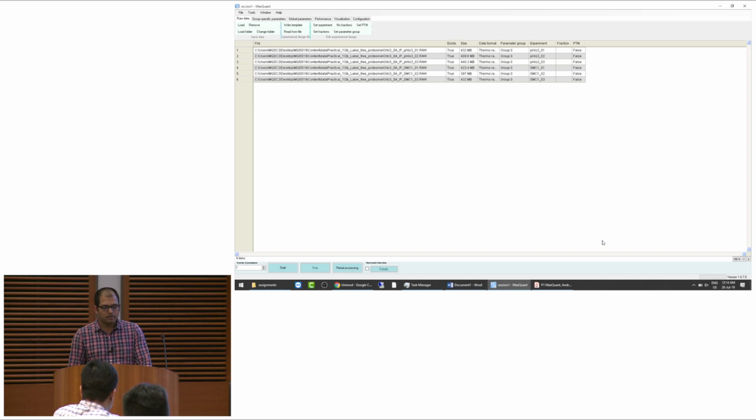Right. When you're loading the files, I learned by trial that I could name the files with a unique base name for different experiments or replicates, but then put underscore rep1, rep2, rep3. And it automatically kept track. I wouldn't have to group things.